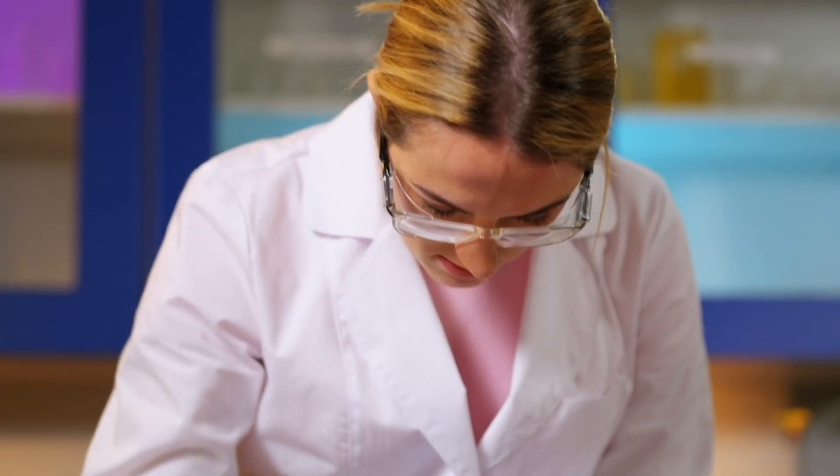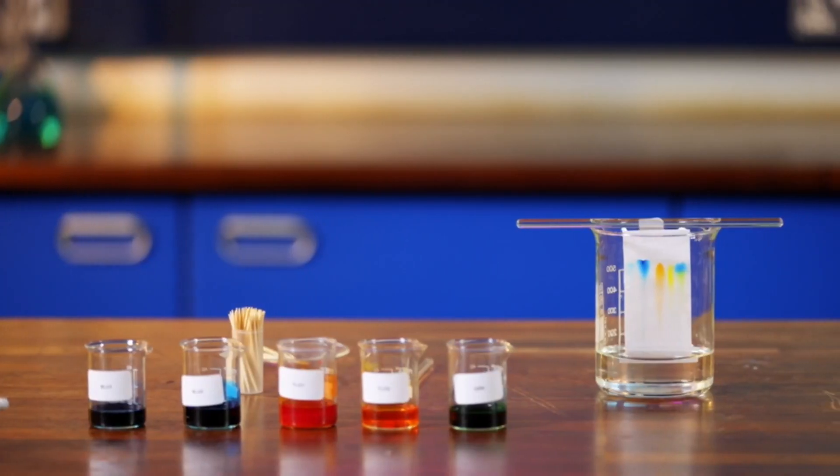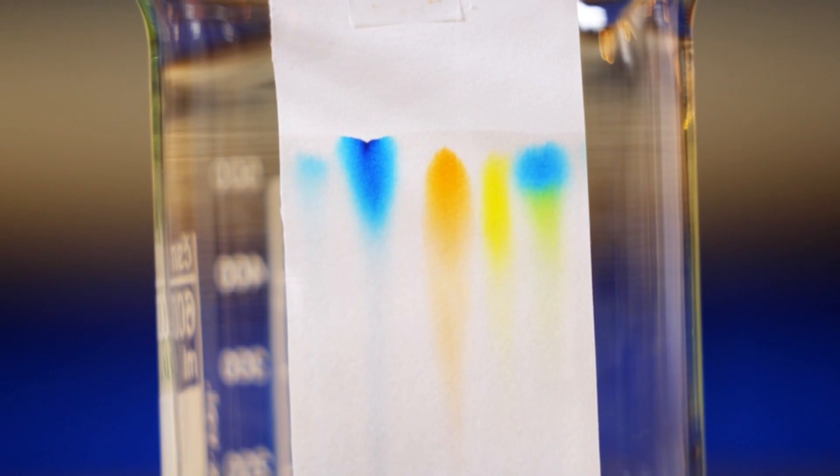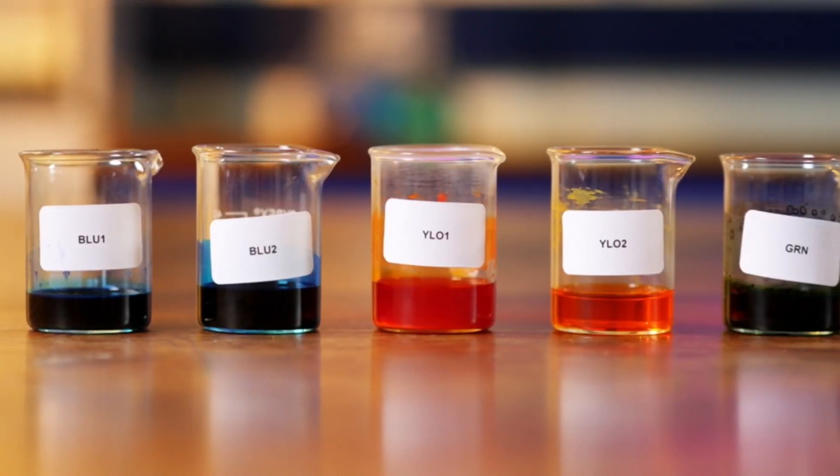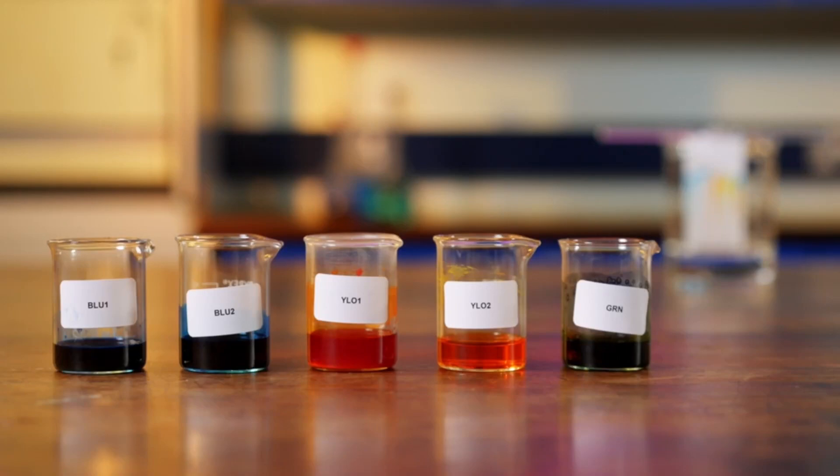Chromatography is a technique used to separate soluble substances that have been mixed together. It's normally used to separate colored mixtures like food colorings. We are going to use chromatography to separate these different food colorings into the colored pigments they are made from.